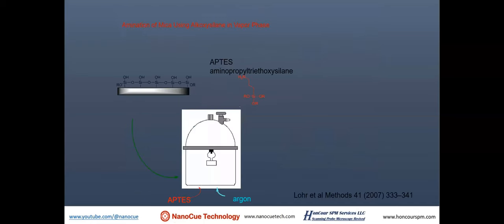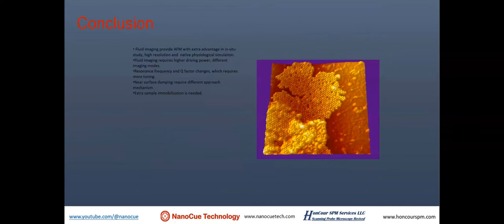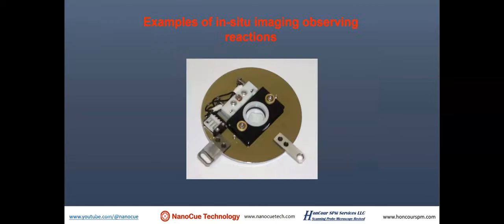So I'm going to skip over this, of these different techniques. Liquid imaging gives you lots of advantages. It can increase your resolution. It can also, because of your liquid existence, you can introduce different kinds of chemical reactions. So I'm going to, using the rest of the time, show you various examples.